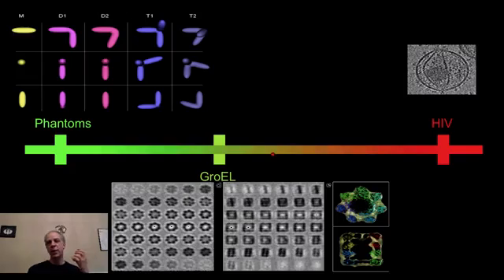The next step, because it's almost impossible to do a perfect simulation of everything that is going on in the microscope, is you take particles that for some reason we know their structure. Maybe because they are larger than the HIVs, maybe because they are more rigid, and they could be acquired with other technologies. And one of them is what's called the GroEL, G-R-O-E-L. So you go into your microscope, you put GroEL, you run your algorithm, you get the 3D shape that everybody knows is the right shape. You say, okay, this is as much validation as I can do. Now I'm ready to do HIV.